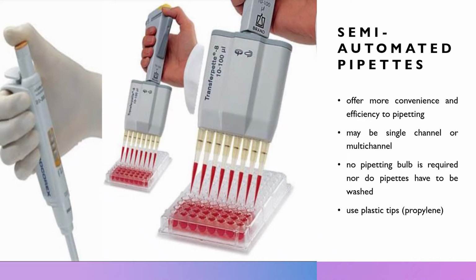You can see that there's a predetermined volume that we could aspirate, only from 10 to 100 microliters. So we just set the measurements here so that the pipette tips could dispense only the required volume that you want. So that's what you call variable models of semi-automated pipettes.